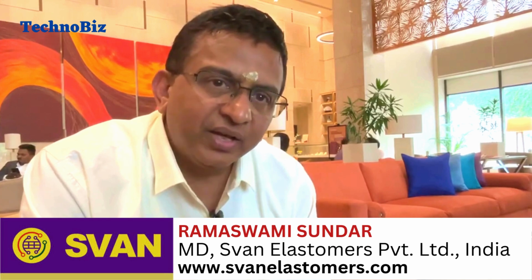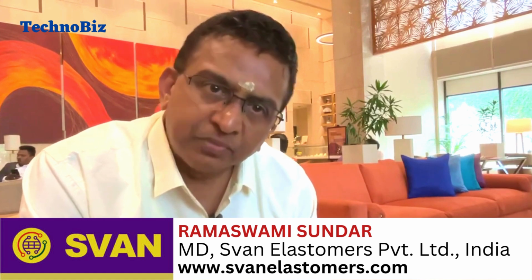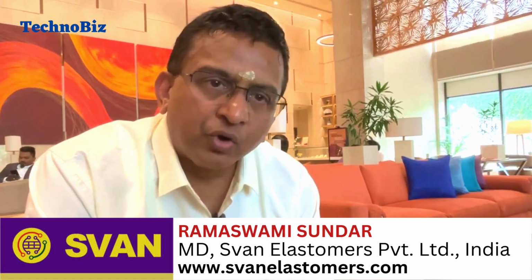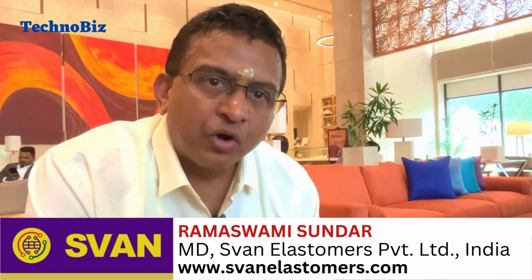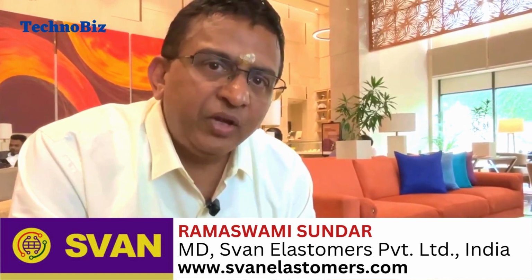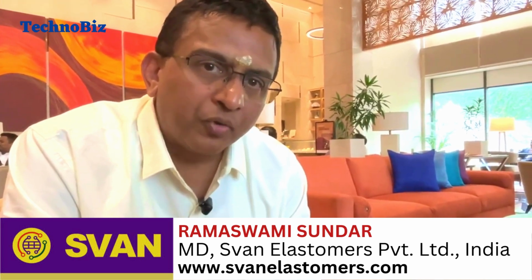The rheometer essentially is like the molding process itself. It is a molding process, but you do it under standard test conditions. That means you control the pressure, you control the temperature, and you control the time. So it is molding under very tightly controlled conditions. Now, this is the interesting part which I want to talk to you about. How can we use rheology to get an insight into the performance of the compound?